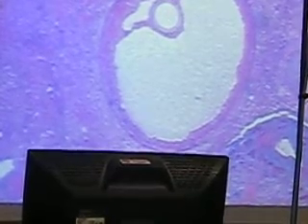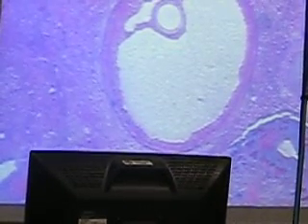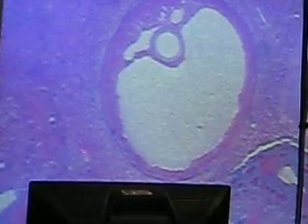And from that point, then the antrum keeps growing, the oocyte matures, and you'll have something like this eventually. This is what we would call a Graafian or fully matured follicle. Inside now we have a secondary oocyte that's ready to be released. Okay, and it's going to be released into the uterine tubes and transported. This is a full antrum. You see the secondary oocyte inside, and this is known as a Graafian follicle.